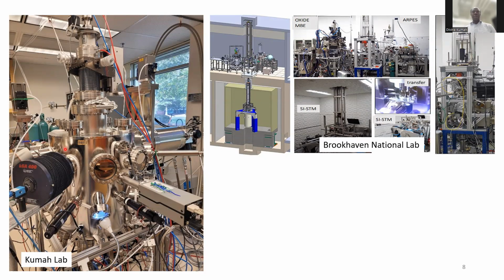The basic components you see here are the chamber, which is where we actually grow the material. At the bottom of this, in this location and that location and all around the base of this system, are the tools which we actually use to form the molecular beams. Those are called effusion cells. And I'm going to talk about how those effusion cells operate.